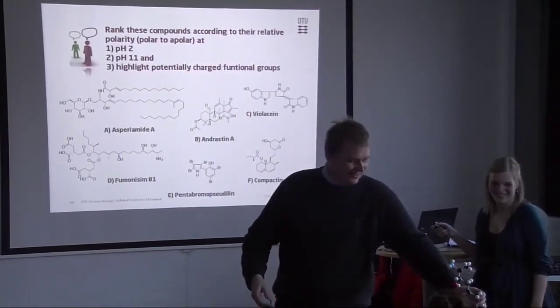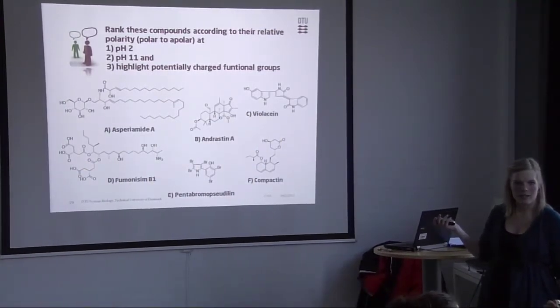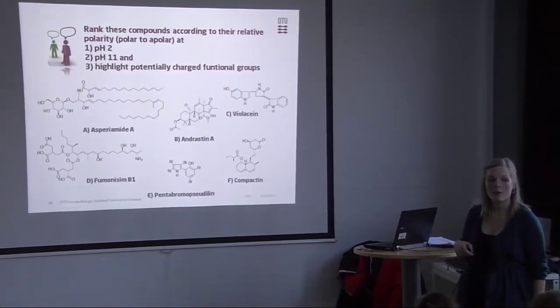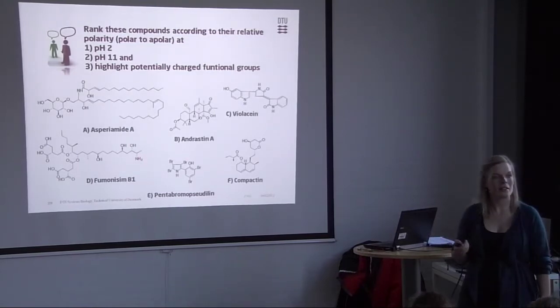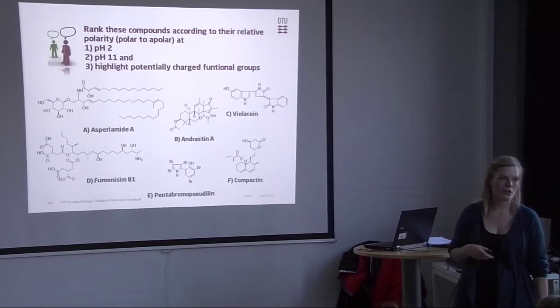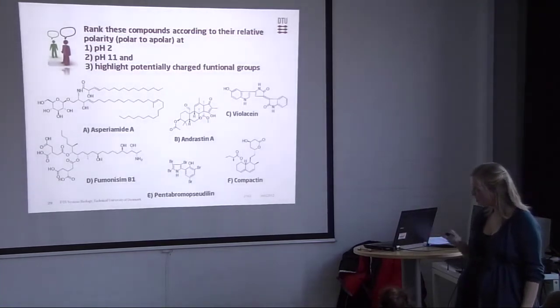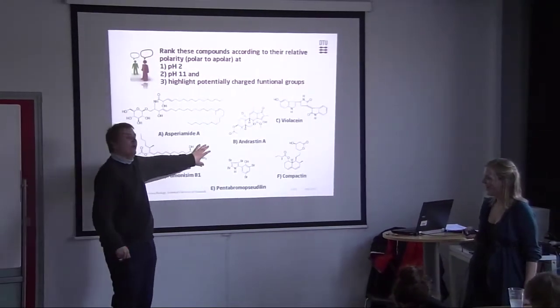So you got this beautiful compound here. So they will be charged at high pH. And here out in the end, we got a primary amine, which will be charged at low pH. So this will have a charge both at pH 2 and pH 11, and this will be polar at all times. So this is the other end of the scale. But four negative charges, yeah, if you go high, means a lot more than one.